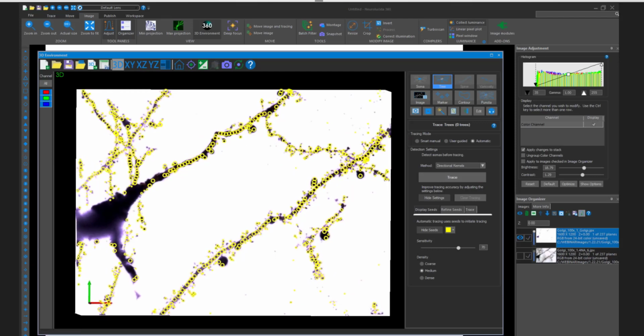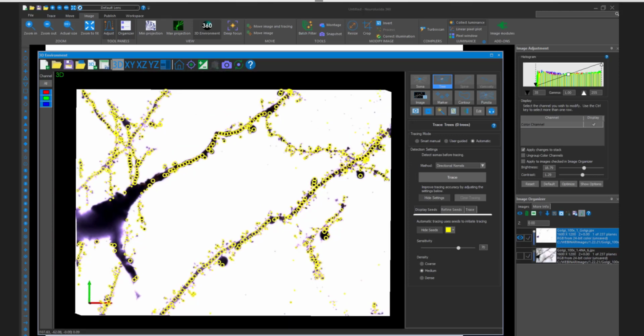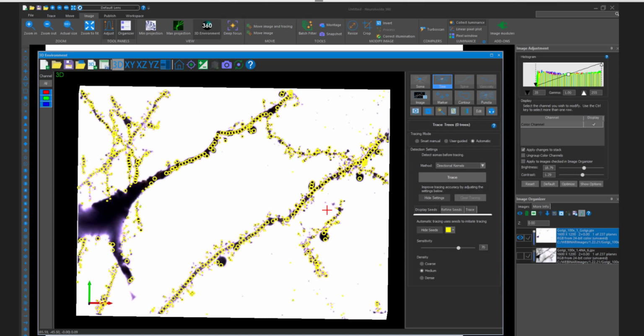One other question we just received was, how long does it take to apply the filter? And I apologize, Bruce, but it's not as straightforward as time. It's very heavily related to where the image is located. It's always recommended to keep it on the PC that you're working with and not over the network.